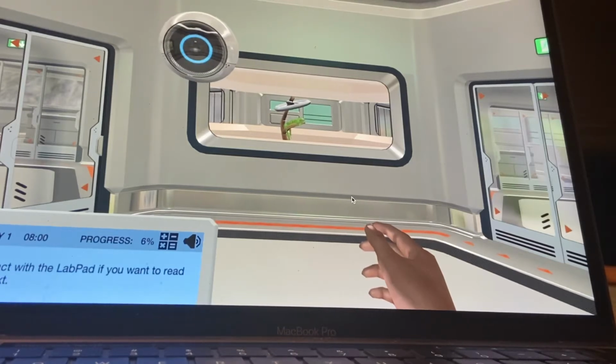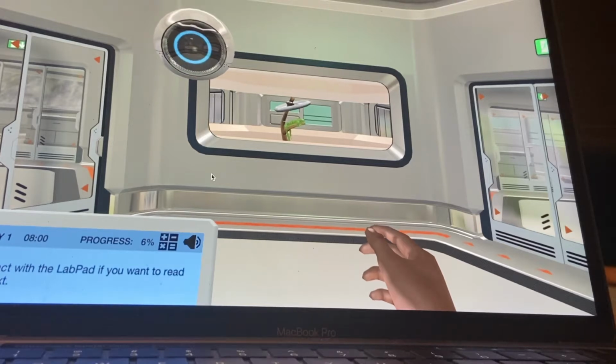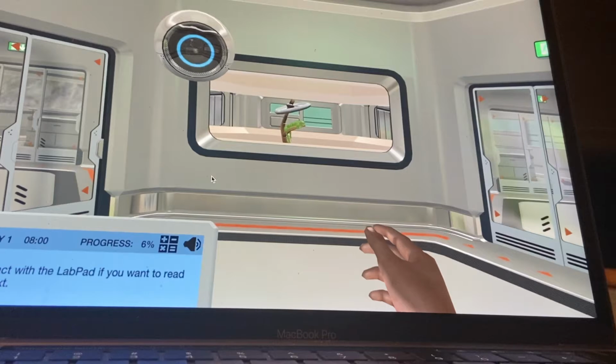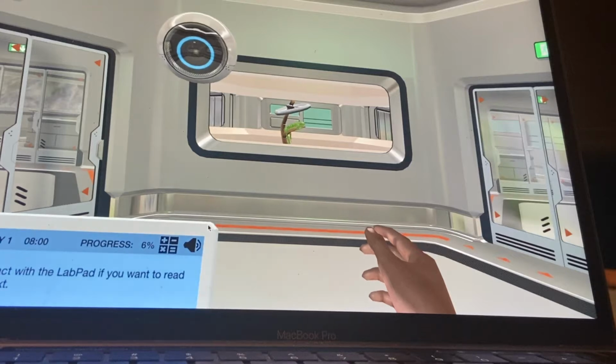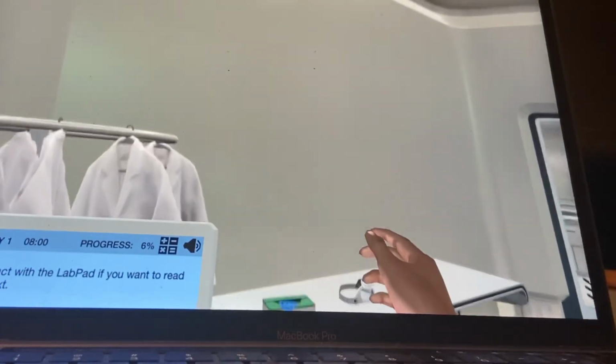Some of my colleagues have asked me to help them prepare a very precise solution of NH4Cl, also known as ammonium chloride, which they need for a chemical analysis they are doing, and I could really use a hand. Will you be able to help me prepare the solution they need, using the right equipment? If so, let's get you suited up for lab work.